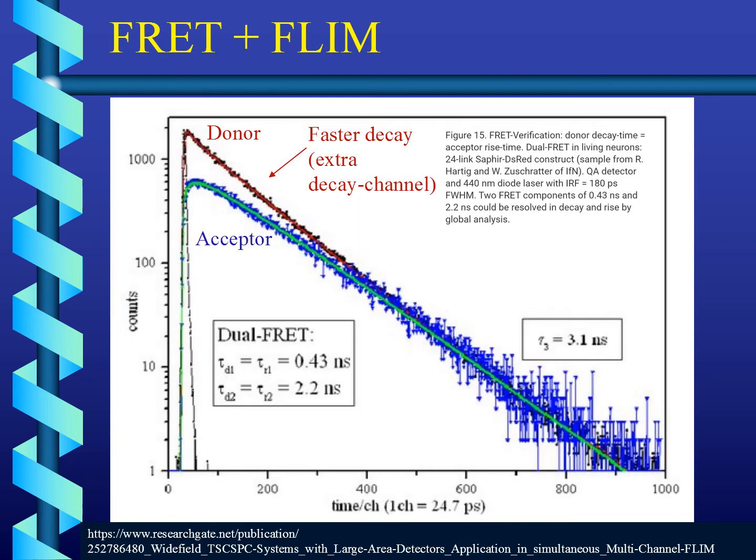Right. So if you then model this and you try to fit your data, you see here a typical acceptor system where you now get a curve from the donor lifetime measurement as well as the acceptor lifetime measurement with the TCS. And now the really interesting thing is twofold. One thing is, as you know already, that the donor has now a faster decay than it would normally have.